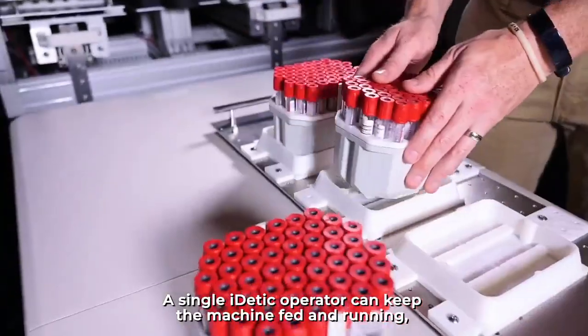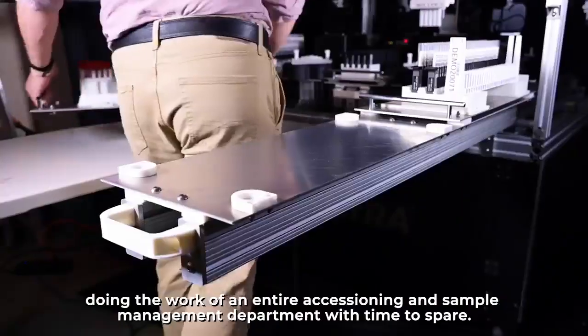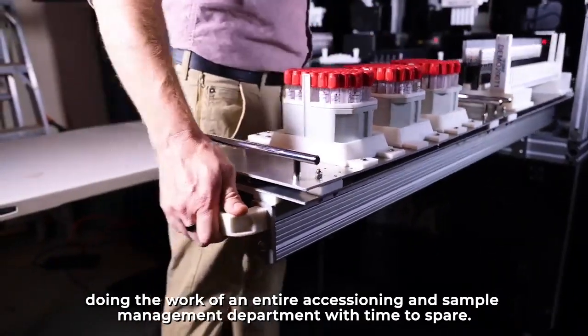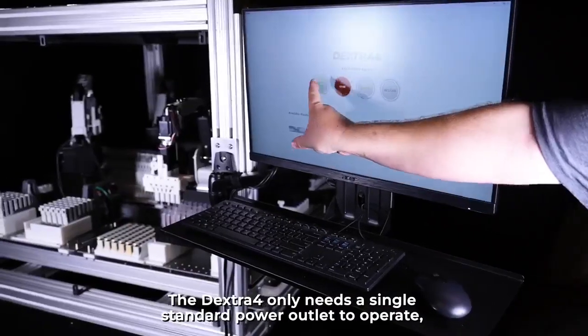A single Eidetic operator can keep the machine fed and running, doing the work of an entire accessioning and sample management department with time to spare.